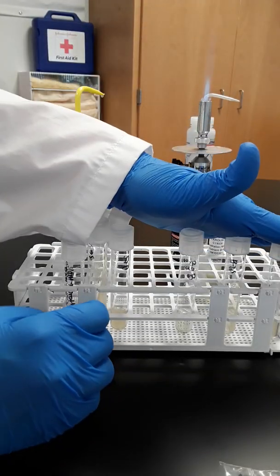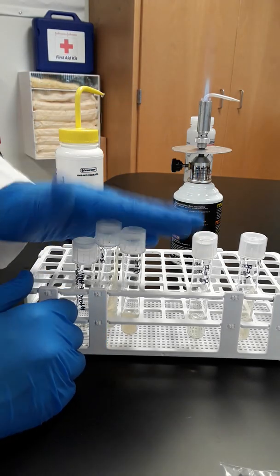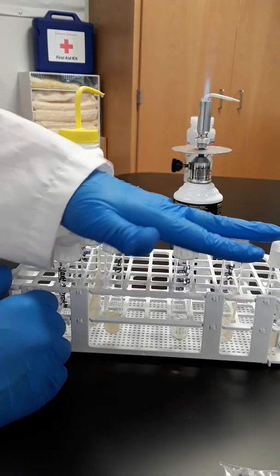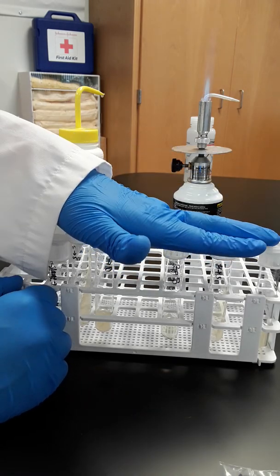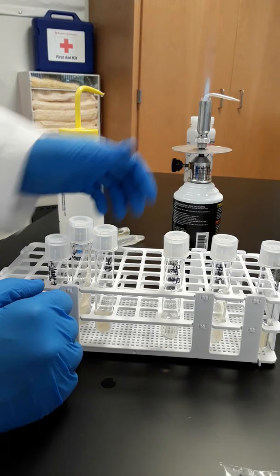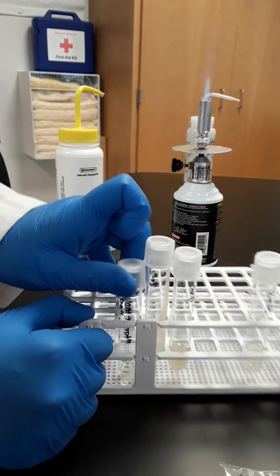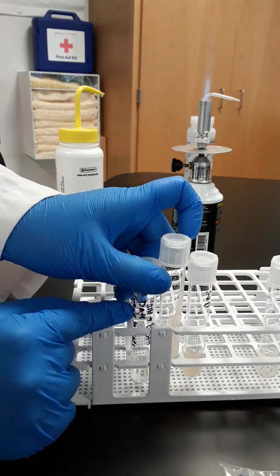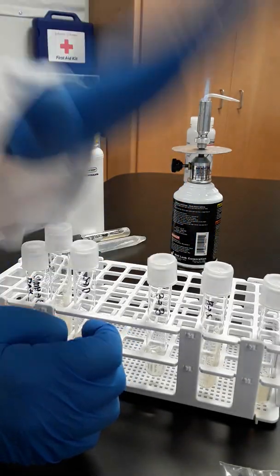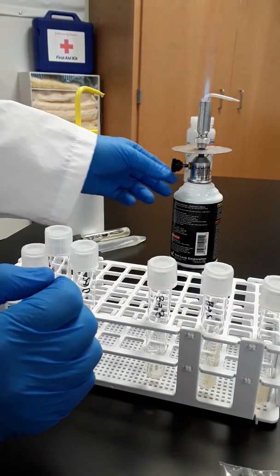Then we take our cultures out and we dispose of them properly, which I talk about in a different video, and then we take our cultures from here and we put them in the incubator at the correct temperature for the correct amount of time. Okay, no special storage on this, just make sure that you have where it came from, the date, your group identification numbers, because there's lots of groups who are going to be doing this lab, and it would be a shame if you couldn't identify whose results are yours.